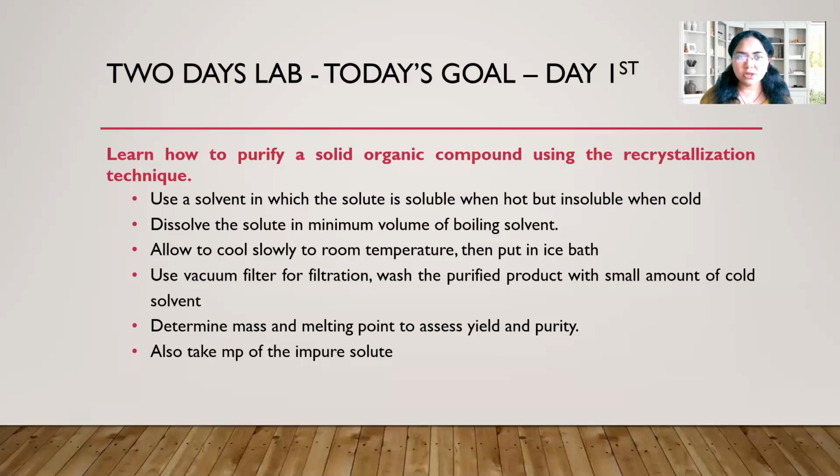Allow it to cool slowly to room temperature and then put it in an ice bath. Use vacuum filtration and wash the purified product with a small amount of cold solvent. Determine mass and melting point to assess yield and purity. Also take the melting point of the impure solute.